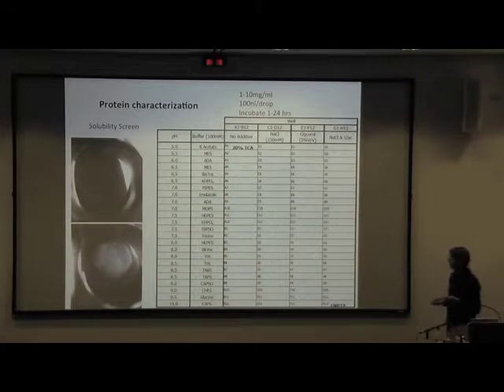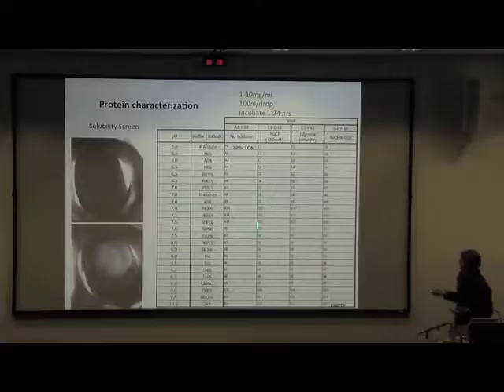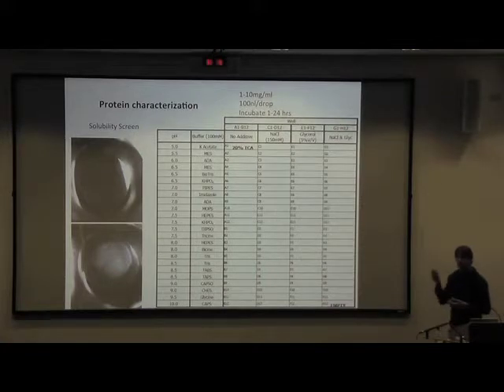At the same time, you may find that your protein is actually stable over a wide range of pHs that you can use throughout your purification. If you want to bind it to an S column, in some cases you need to lower the pH to, say, 6. I wouldn't go much lower, but if you know that your protein can be happy at pH 6, then by all means use that. And if you can bind anything on an S column, it'll be very pure, because very few proteins do.